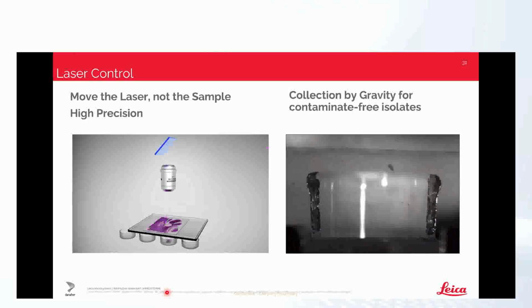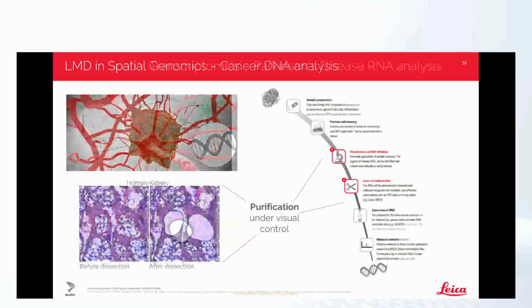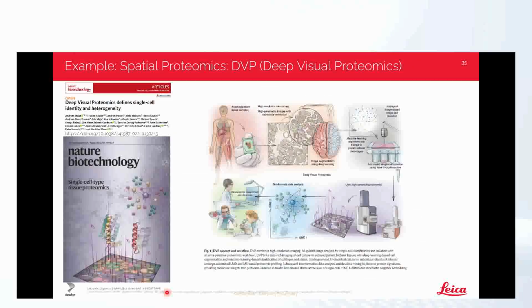The types of things we look at in our isolates could be looking at things for actually isolating nuclei and sequencing their DNA. We could move into ways of looking at RNA for single cell seq of different regions. We could also look at collecting a whole bunch of plaques throughout the brain to see what's in the different tissues or individual regions for analysis. But what I want to highlight is kind of a new one that's come out of Matthias Mann's lab at Max Planck, and that's deep visual proteomics using this technique. And so the basic flow here is, here's this beautiful tissue section. Perhaps it was from BioChain.